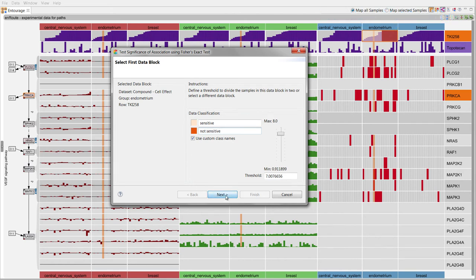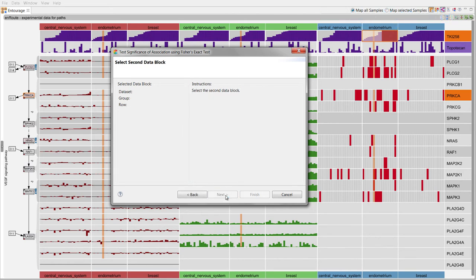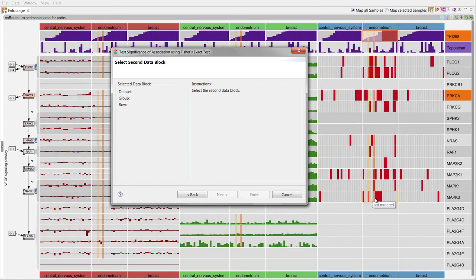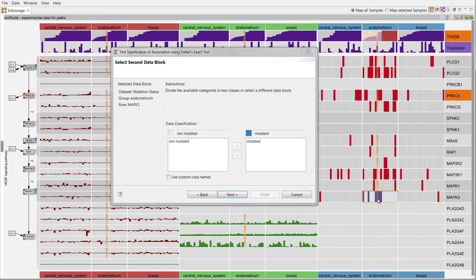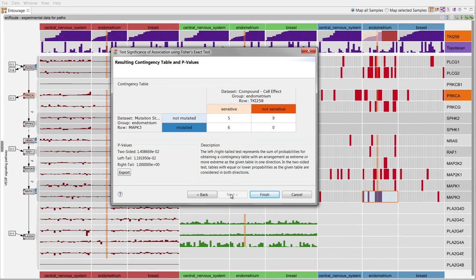Then we classify a second data block from the endometrium samples into two groups. We select the mutation data from MAPK3 and use the suggested classification into mutated and not mutated samples. The system then executes the test and the resulting contingency table together with p-values is shown on the last wizard page.